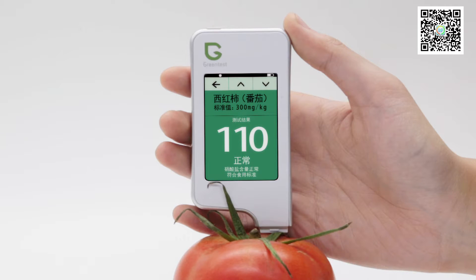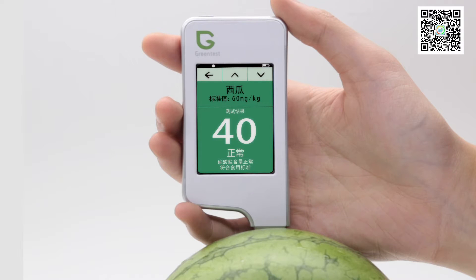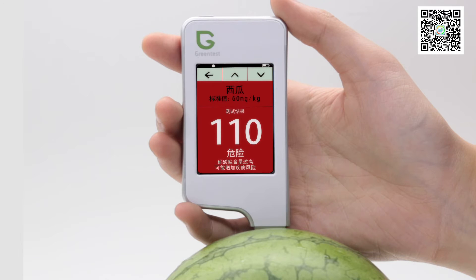To have a better understanding of the test results, there are three colors designed to distinguish the nitrate content. Green means safe, yellow means excessive, and red indicates the nitrate content is seriously over the limit and dangerous.